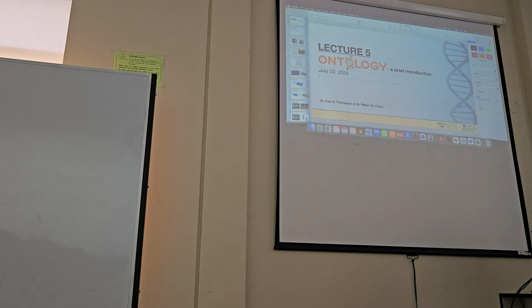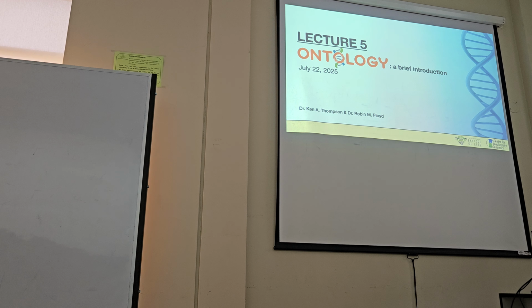Okay, so now we'll have a short lecture about Ontology, which is the software that we made. Then we'll use it together to do barcoding and bioinformatics, and we'll show you how we do it. Later in the course, we have a couple of Mac computers available. Ontology right now only works on Mac because that's what we use. But later in the course, we have, I think maybe between us, 2 more Macs, and so we can give a couple of you them to work on.